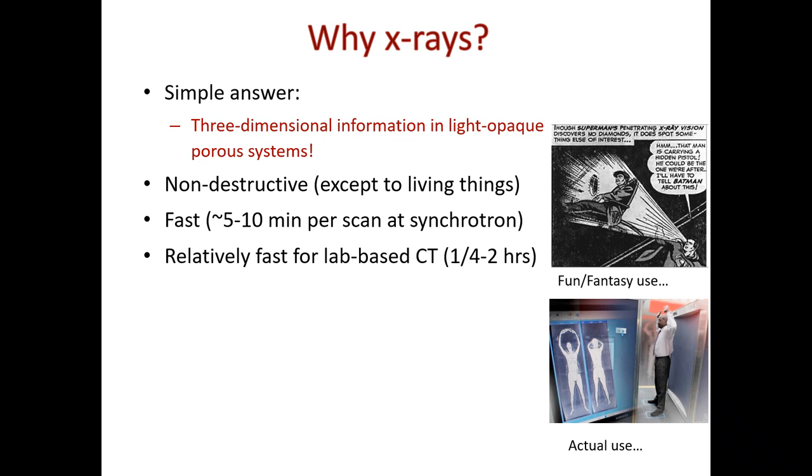However, the heavier the material, the moment you have a sandstone, this is not necessarily going to be as fast. And when I say 5 to 10 minute scan, I didn't mention whether it's one projection or multiple projections. Okay? So other than with the most powerful synchrotron, I cannot yet image an entire sandstone in 5 minutes.